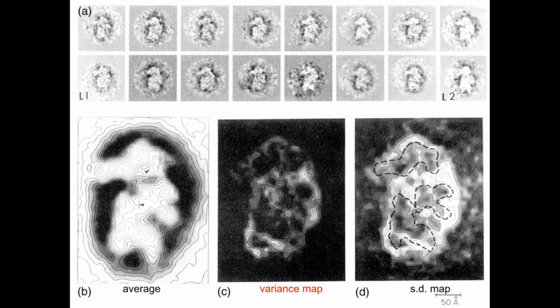And this is because this is a situation of negative stain, where the image is really the image of the molecule that is created by stain exclusion. And the main component of variance has something to do with the fact that the stain laps up to different extents. And it's a meniscus effect. So the highest inconsistency is really exactly on the border, because the stain is at different heights close to the molecule. So I can stop here.